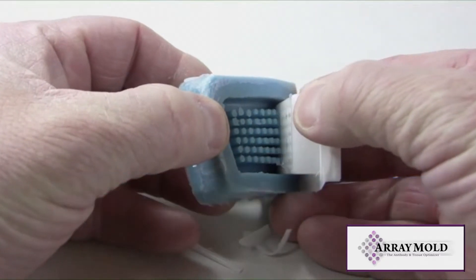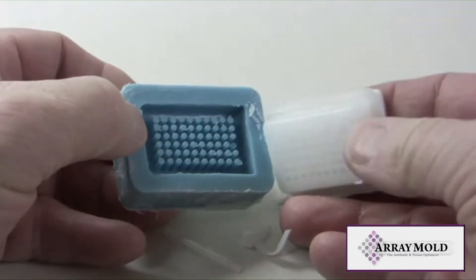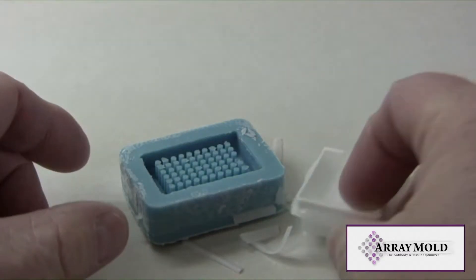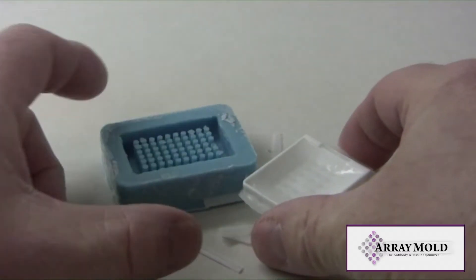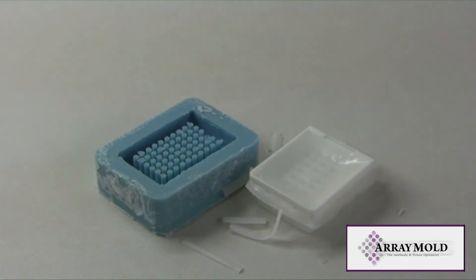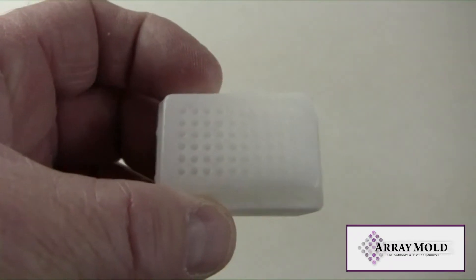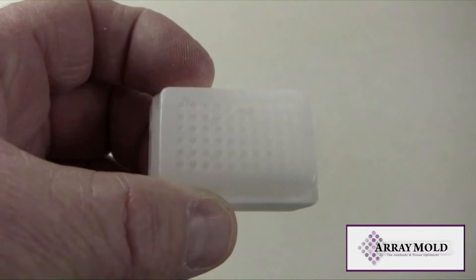The array mold we're using here is one of our first created. As you can see, it came to us with a short core rod in it. Since we couldn't sell it, we've been using it for our testing. In the last three years, I believe we've made around 40 to 60 paraffin arrays with this single array mold.